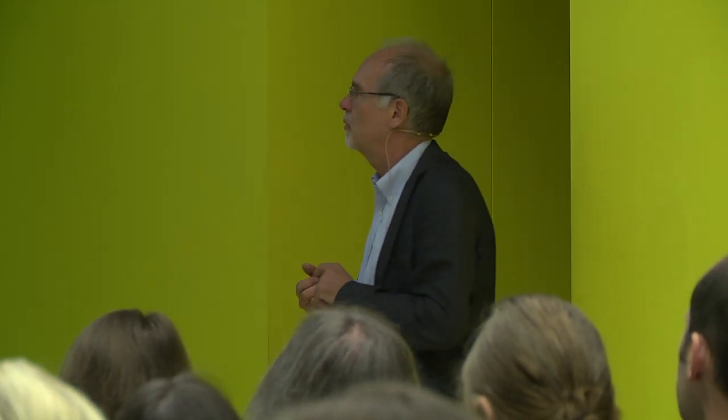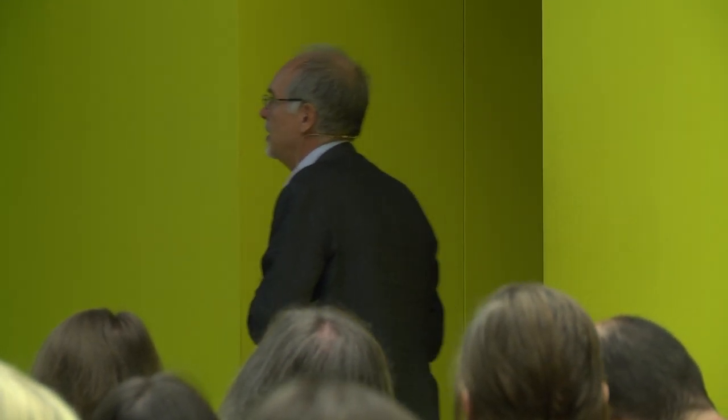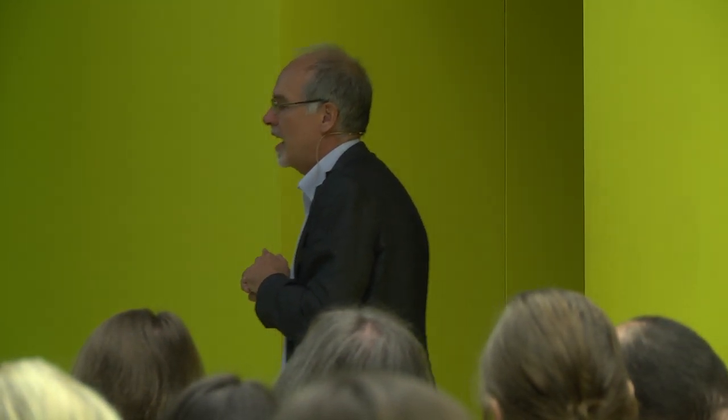So typically what we do here, and we're working closely with Brandon to make it directly interactive with Skyline, which works, but we also have to work on the next generation I'll discuss later on, is take the raw data, and the two parameters you need to define are the windows for which you want to extract, let's say typically 10 ppm. And I showed you an example before where it shows how the window affects how you can look at the data and what impacts on the array data. And by default, we may extract the 6 or 8 most intense transitions, right? So they're already there. And then you generate basically an SRM-like file.